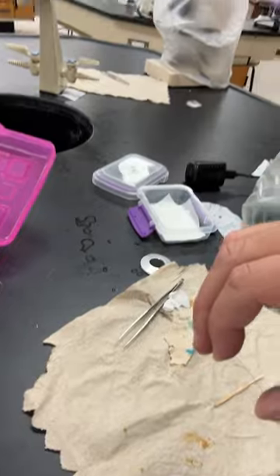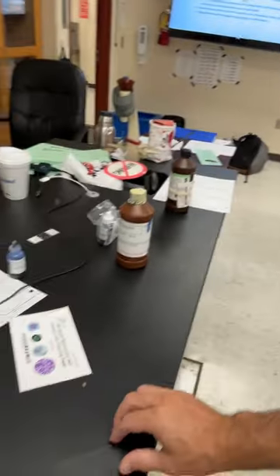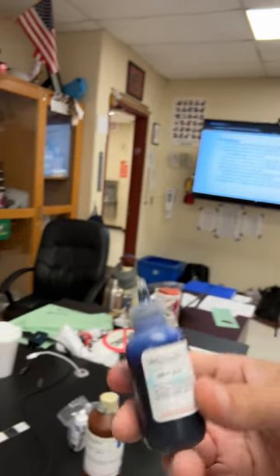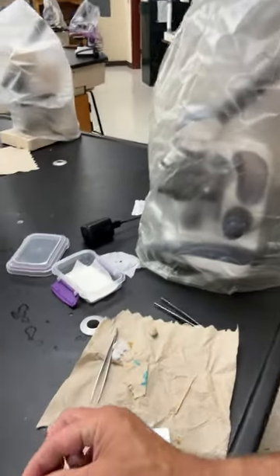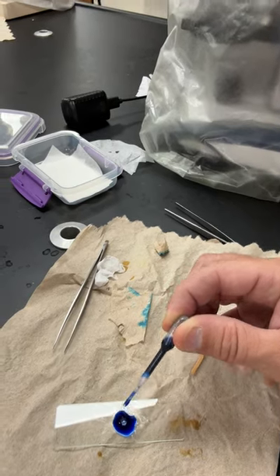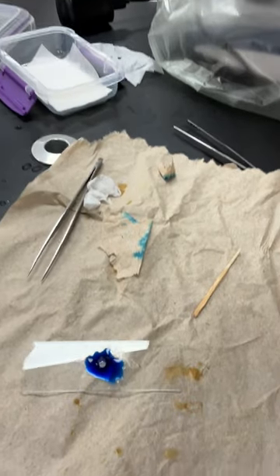After that, you'll add your stain. What we're going to use today is this methylene blue stain. It's diluted because we don't need a super intense stain — I put a little bit of water in there. You'll take the pipette and put about two drops on the slide. Let it set for about a minute to let it soak in.